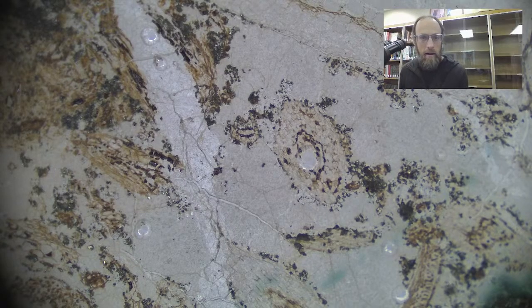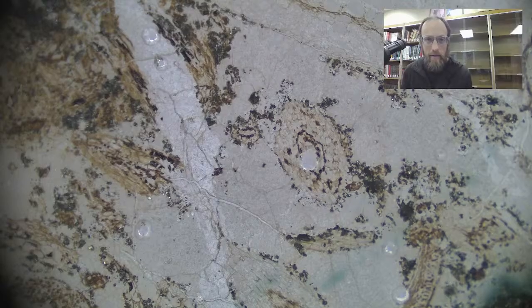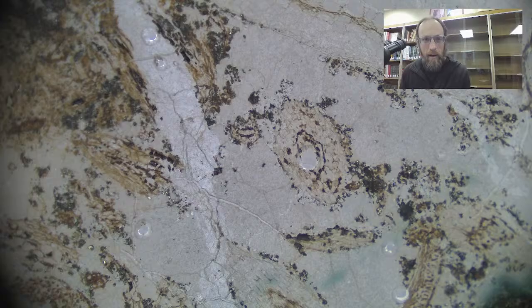We see that there's a lot of pyrite accumulation here. More on pyrite as I learn more about it, but I perceive it as noise mainly, but it could also be evidence of past metabolic activity or exposure to microbes.